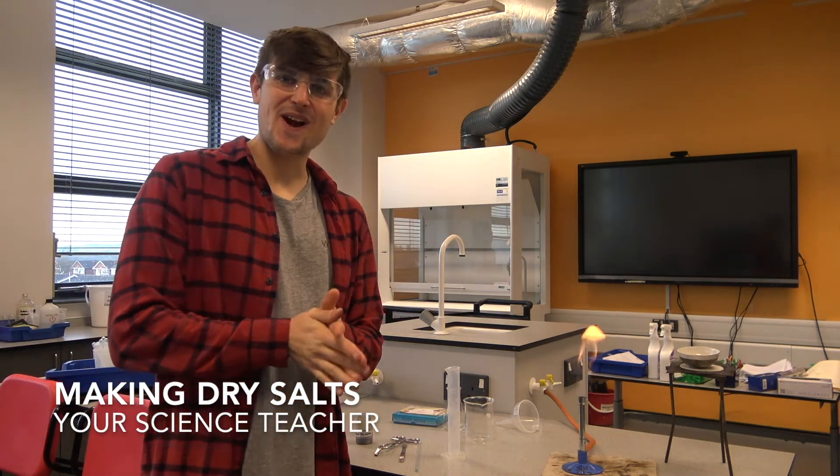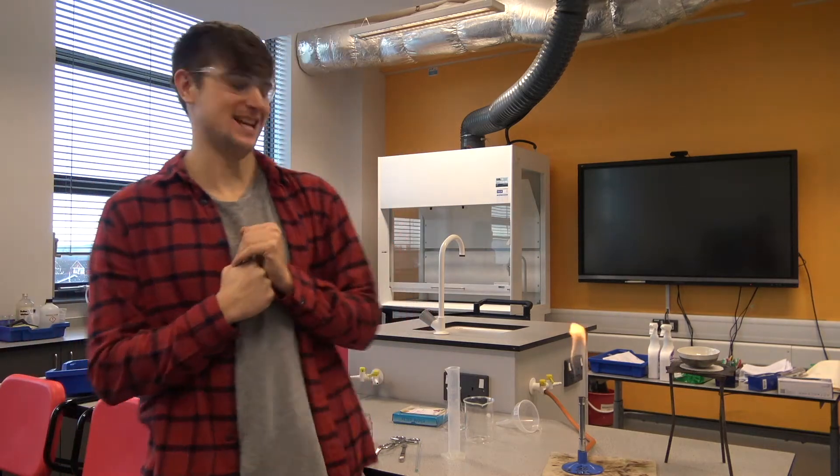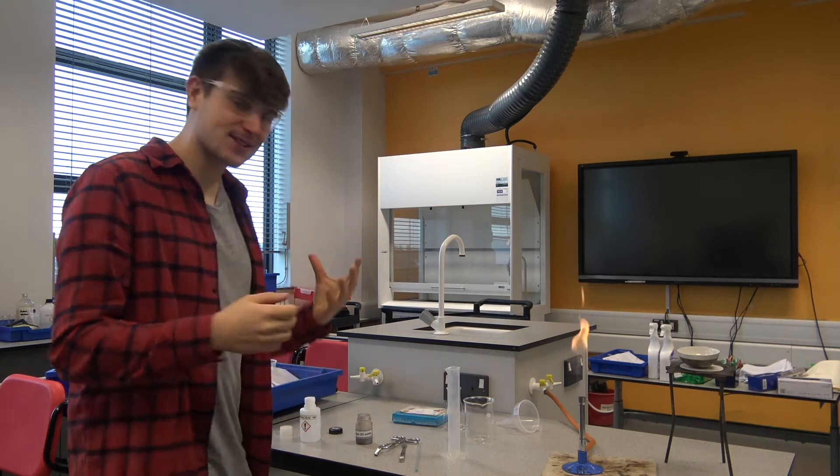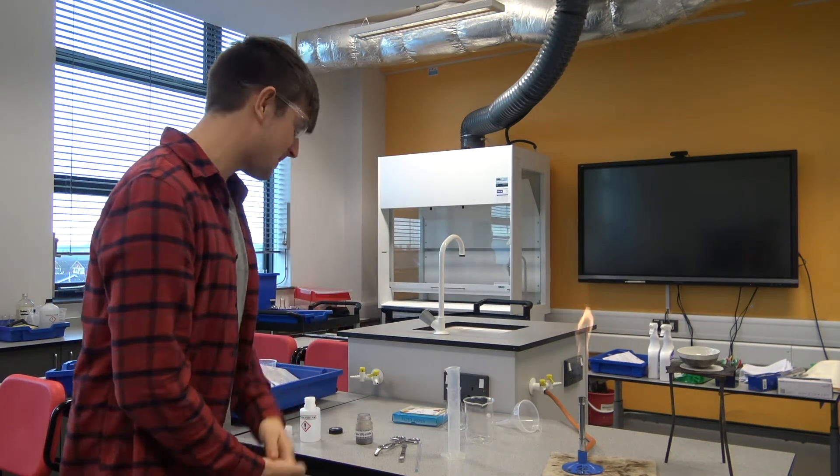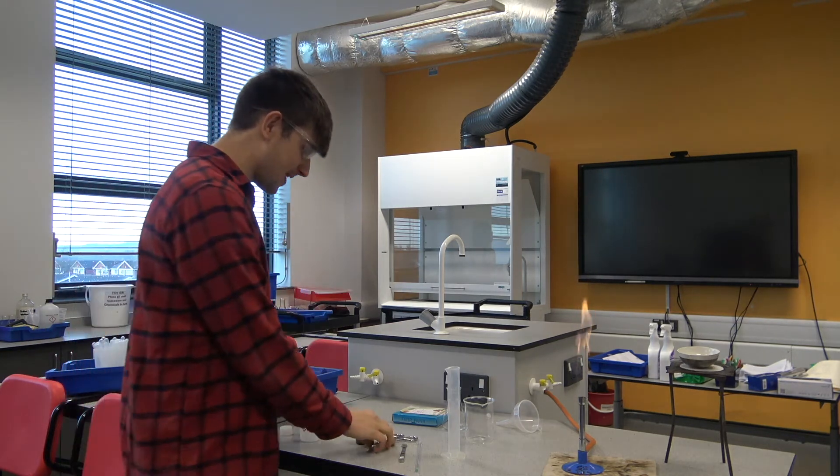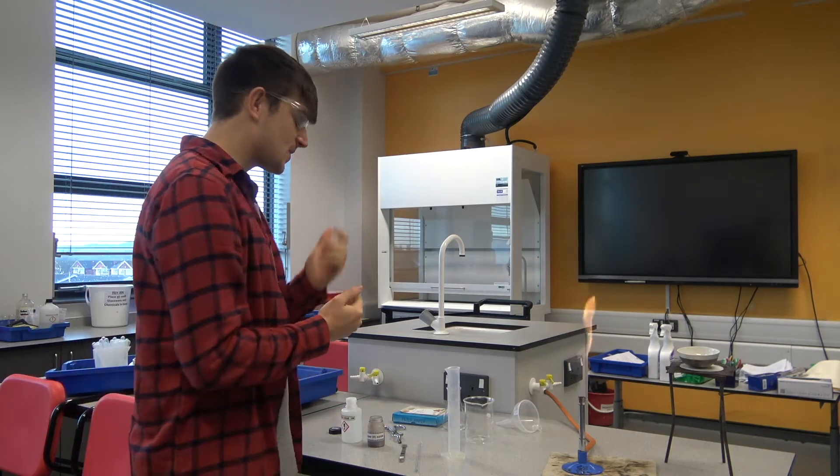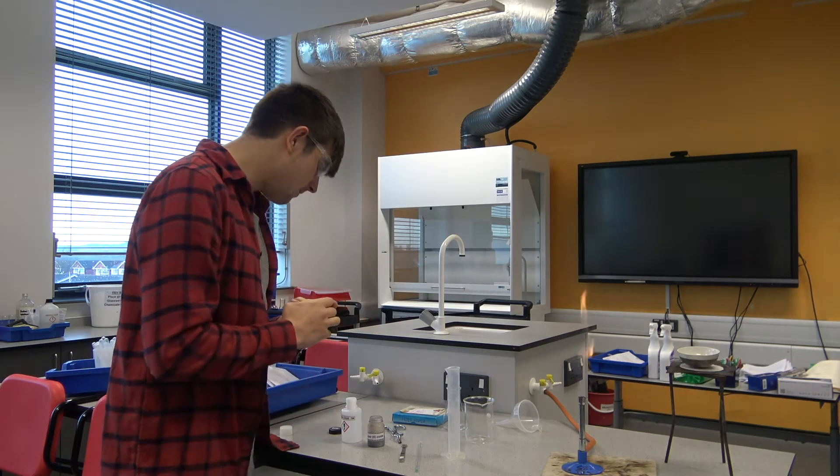Hi guys, in this video I'm going to go through how to make a pure dry salt. We're going to make a salt called copper sulfate, and you've probably made this in your lab yourself, but I'm going to go through the main steps that you need to remember. This is one of your required practicals, so you are going to need to know how to carry it out.